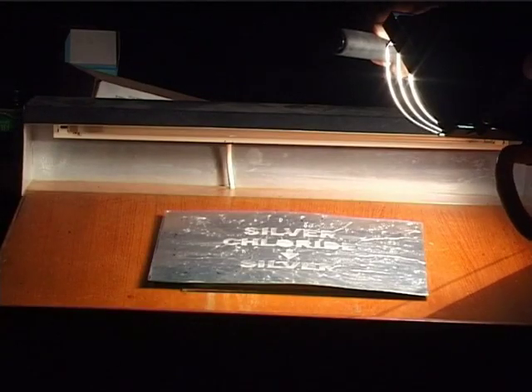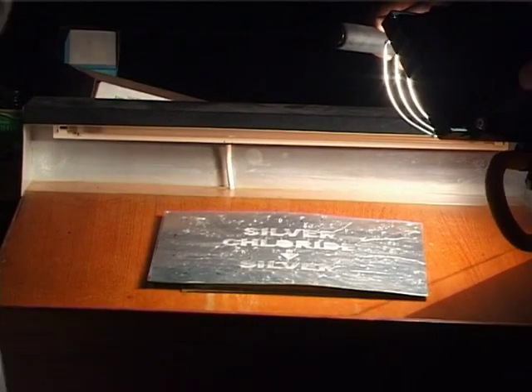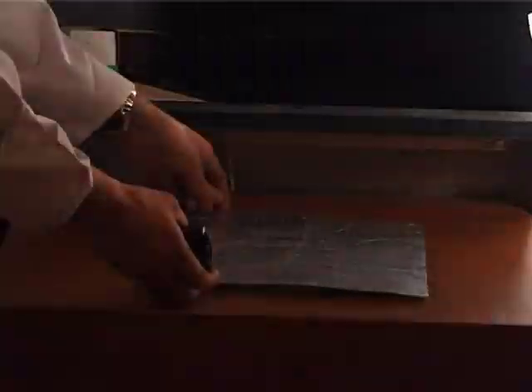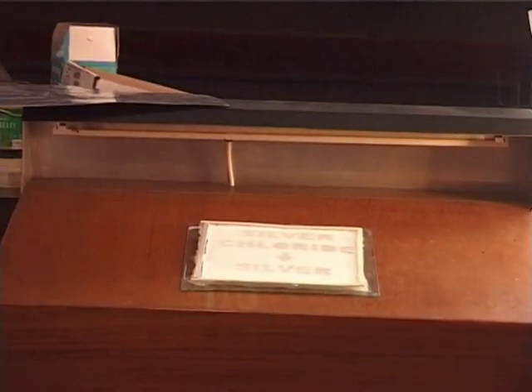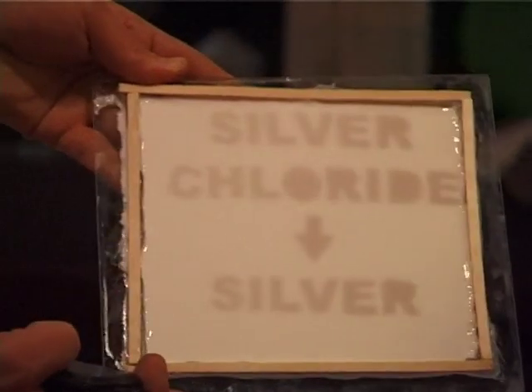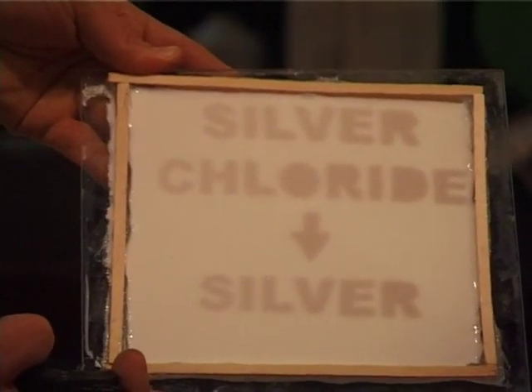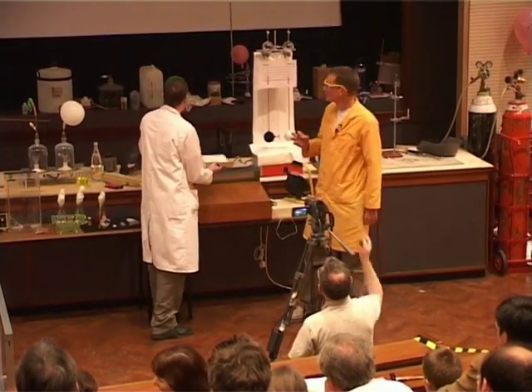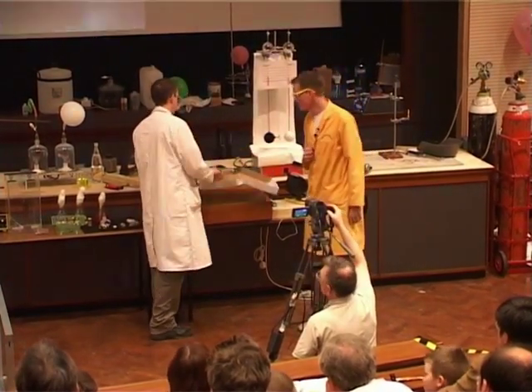So we just need to give it a decent amount of time in order for it to react. So let's try this. Okay. And if we hold this up, we should be able to see here, there we are, silver chloride going to silver, and this reaction is brought about by the light energy.